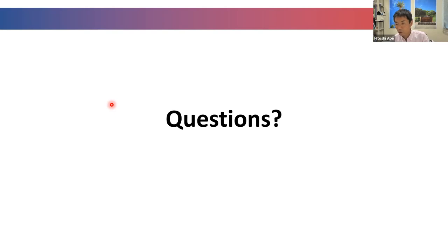And we have another question. The mic is not working. So the question is: once you reach the condition of gate opening at 80 Kelvin, did you try to warm up the sample back to room temperature? Does the system go back to the same condition as at room temperature, or does it stay in the same condition as at 80 Kelvin? So is it reversible or irreversible? Yes, we did that, and we confirmed that we were reaching back the initial state. So it was reversible, but that had already been proven by the isotherm measurement. Okay, good. Unless you have burned your sample.